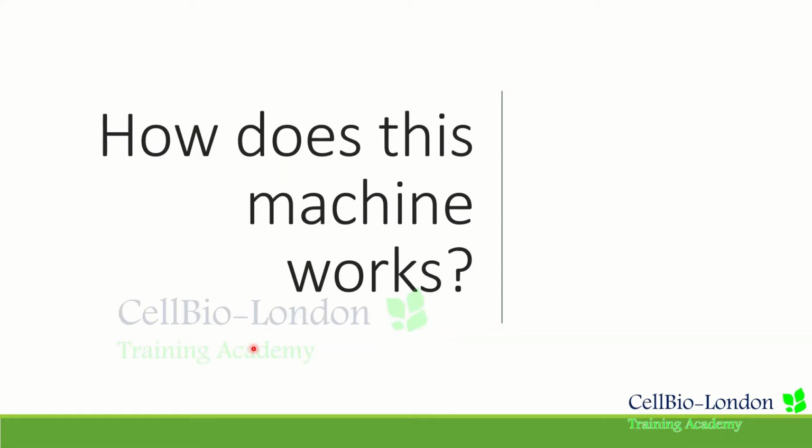So how does this machine work? We need to understand how the flow cytometer works in order to be able to adjust the settings, to be able to interpret the histograms and all the information that comes out from this machine, and also to be able to get true results that reflect true information.